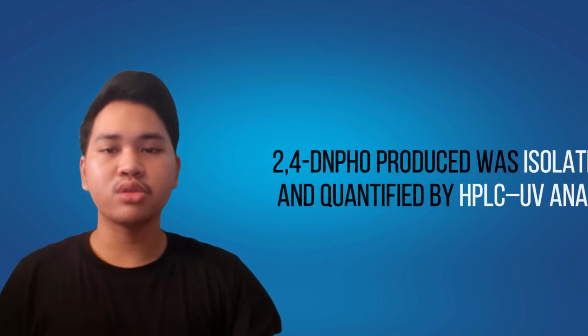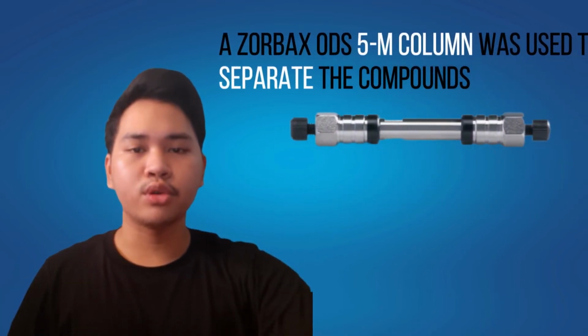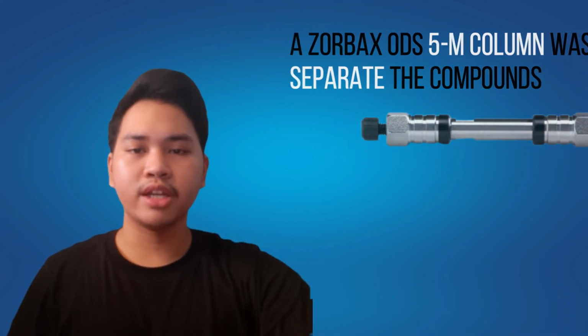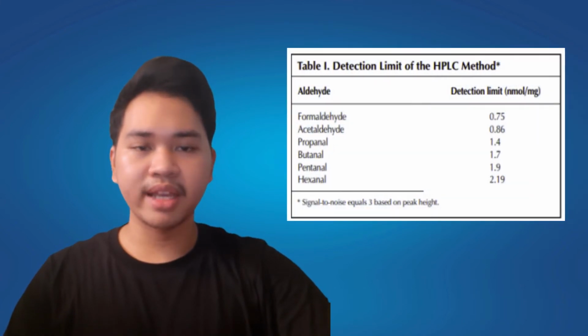The treated compounds were eluted with acetonitrile and the 2,4-DNPH derivatives produced were isolated and quantified by HPLC UV analysis. A Zorbax ODS 5 micrometer column was used to separate the compounds, with an acetonitrile-water combination as the mobile phase. A Varian liquid chromatograph type 2510 was also utilized. Absorbance was utilized to detect the chemicals. The new method was successful in detecting the presence of multiple aldehydes.